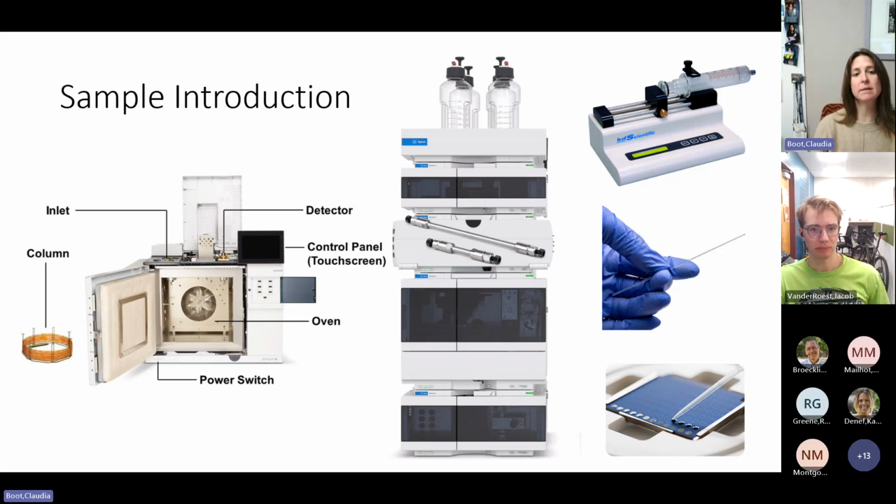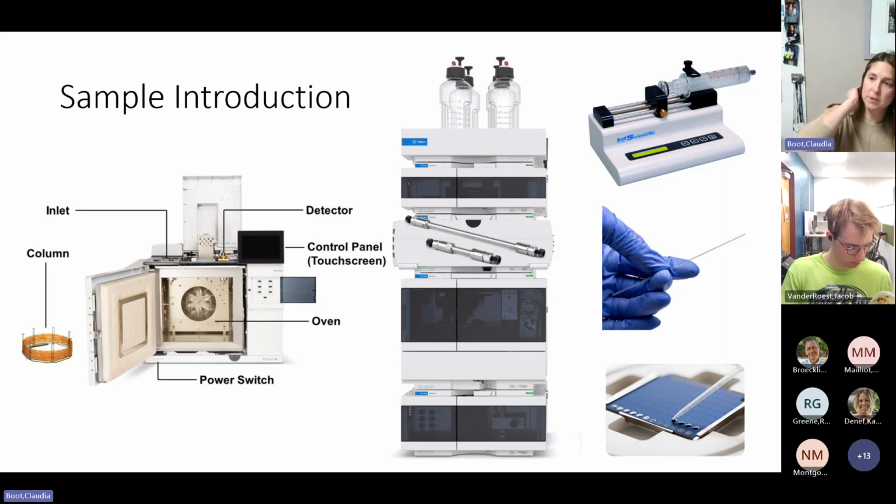This is basically a gas chromatograph, which is an oven that has a column inside, and you introduce your sample. Sample separation is really driven by the boiling point of the molecules and some interaction of the molecules with the column. So they go through, it separates the mixture, and then in this case, our detector will be a mass spectrometer. We also have liquid chromatography systems where you have your mobile phase, our solvents up here, and our systems are all reverse phase chromatography.